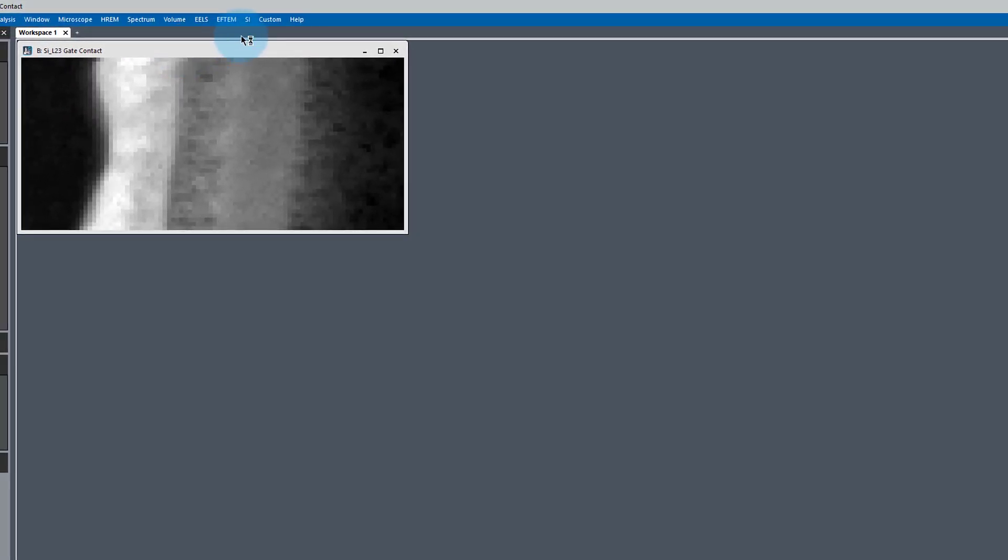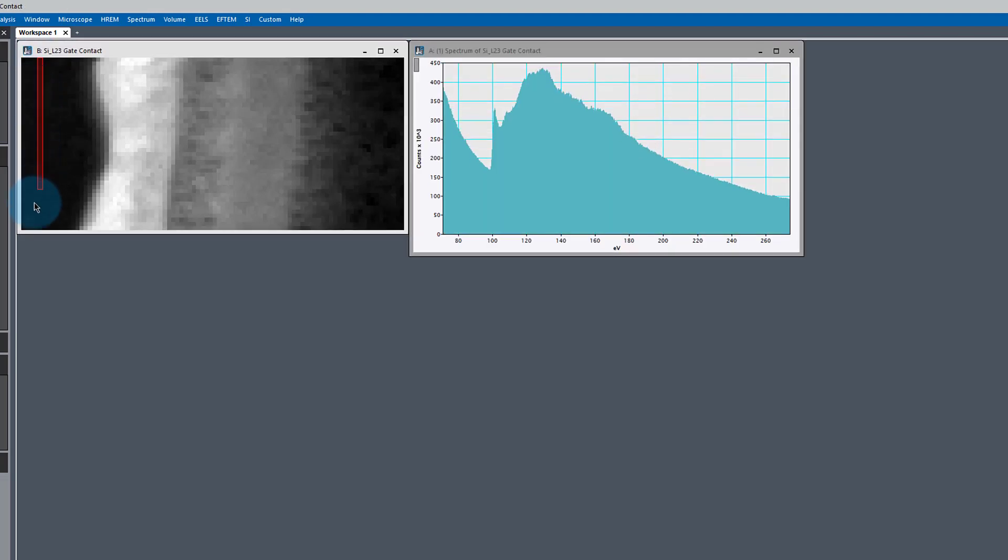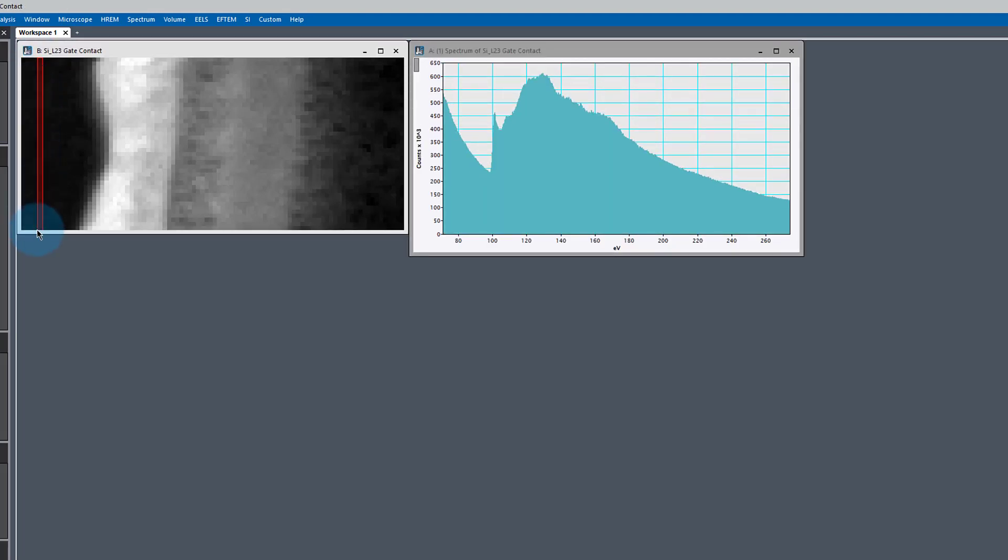This is data taken from a semiconductor device. Let's use our spectrum picker tool. Hold down the control key, click and drag to get a spectrum.